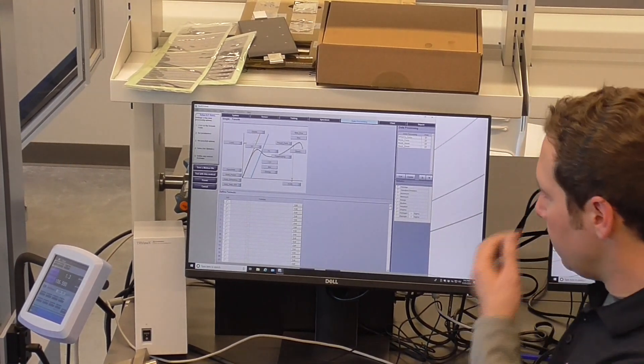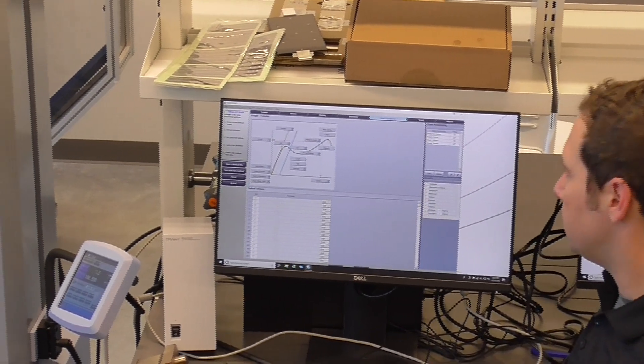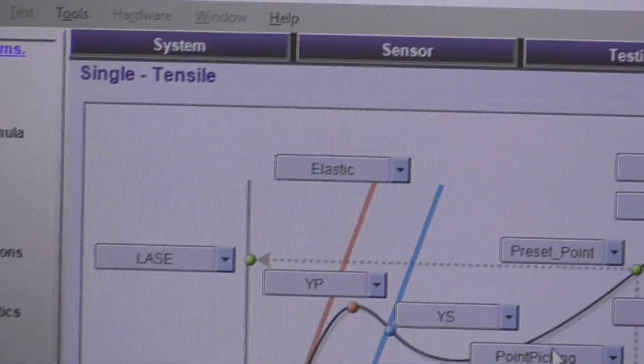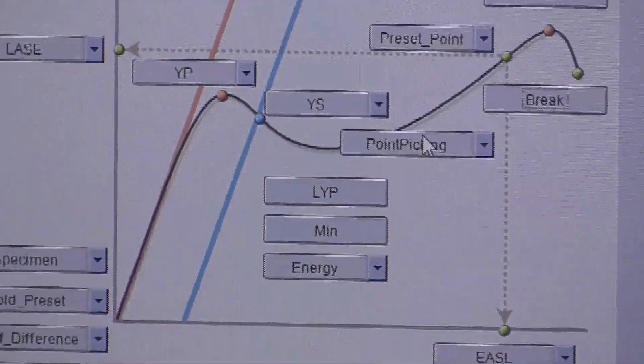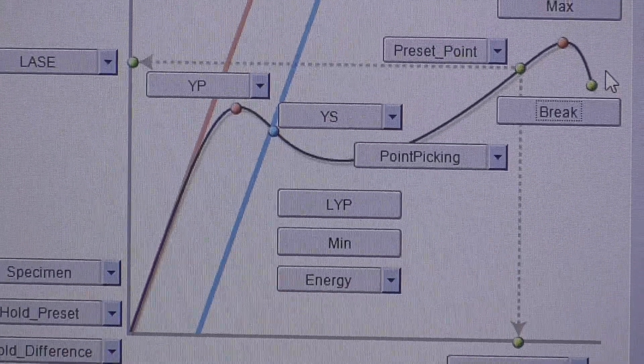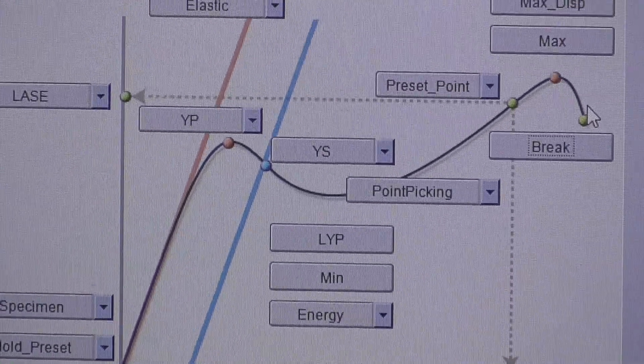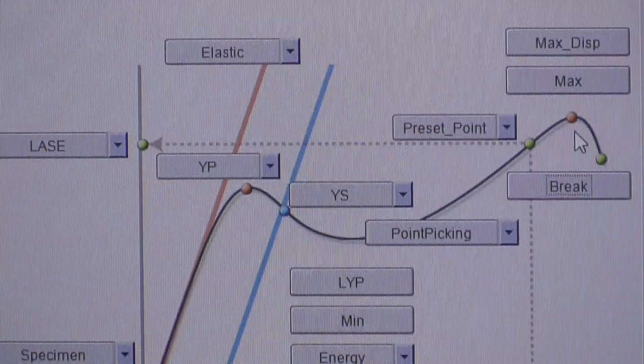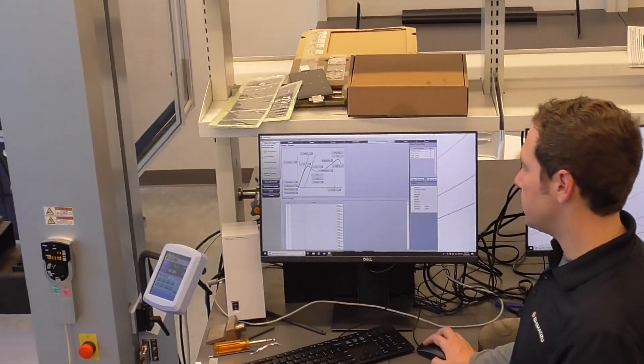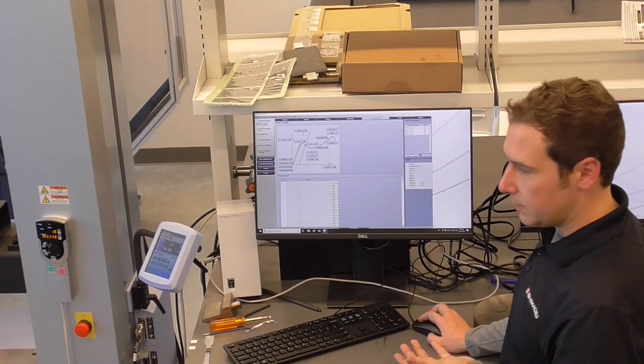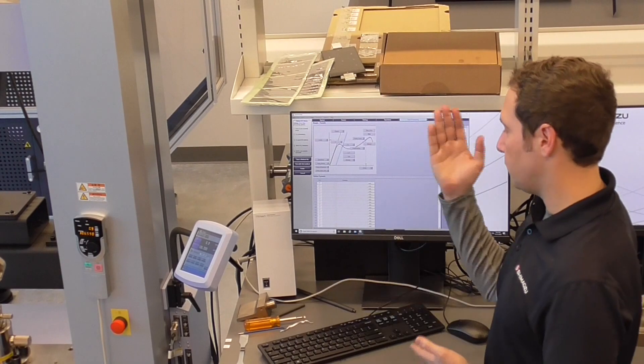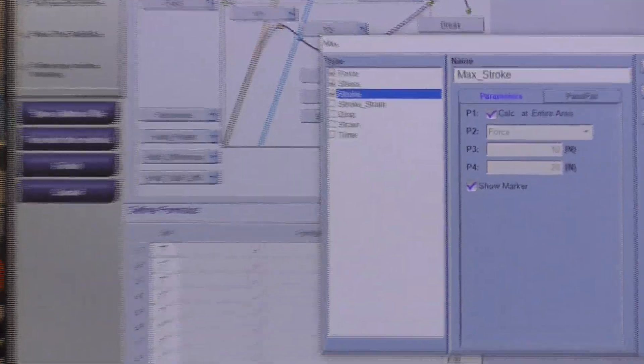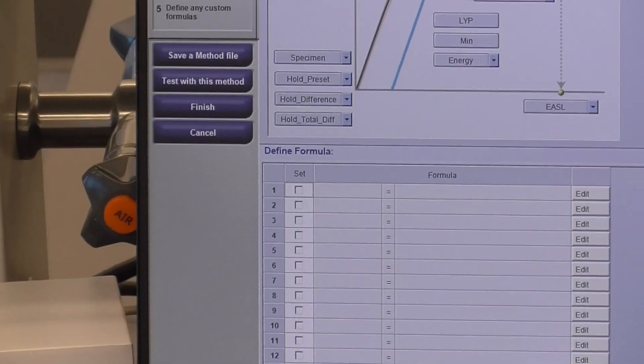So other interesting things that are common to pick from here, you can select your elastic modulus, you can detect your yield point. Some other features include point picking, so if you have certain features along your graph that you kind of want to mark, and then do data processing from there, you can point pick, from post-data analysis. Like I said, there's a lot of things and a lot of variability that you can configure in this screen. This is where it gets kind of specific to your type of testing. For standard dog bones, break force, break stress is really important. Your max force is very important if you have a sample that has a tendency to neck as opposed to just breaking the screen lead. So you can select your various data processing points at your max value.